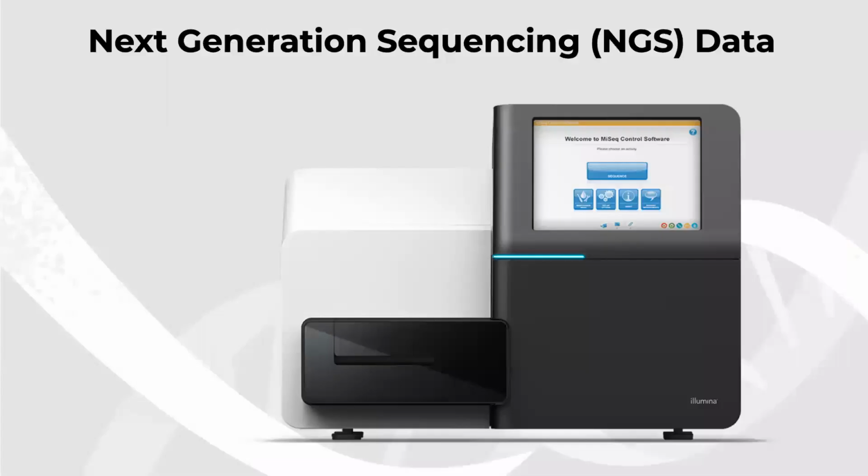So the next generation sequencing data takes short reads, and without amplifying any particular region or specific transcript, gene, or exon, it just generates short reads from random locations throughout a specifically designed probe that amplifies, for example, poly-A tails that are attached to mRNA. So that's how we can know that we are only sequencing mRNA from the host cell.